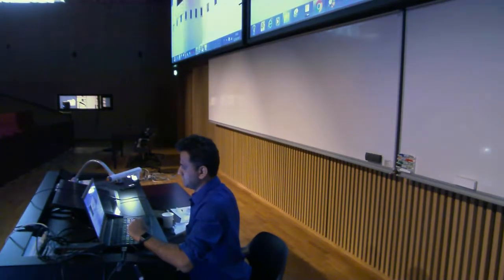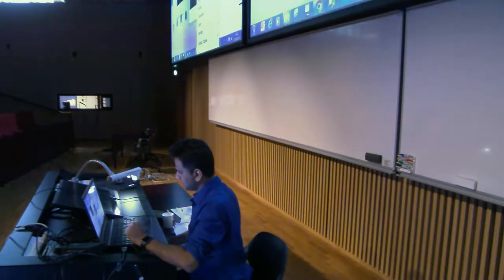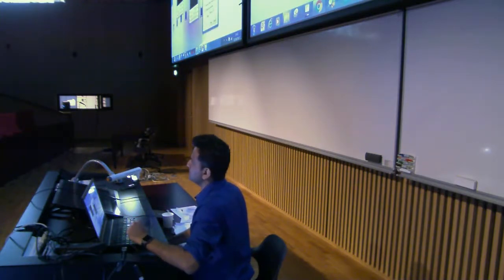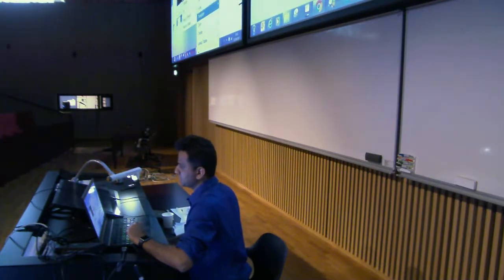Image, duplicate. Okay, so this is all about the stacks. As I said, duplicate, you can rename it, you can scale, you see, you can actually resize your data. Now it's 1-to-1 correspondence, but you can change it to 0.5, and then it will be reduced to half. Yeah. Then rename, transform, you can rotate horizontally, vertically, different angles that you are interested in. Zoom in, overlay, that's not important. Okay, so this is all about the properties within the image tab.